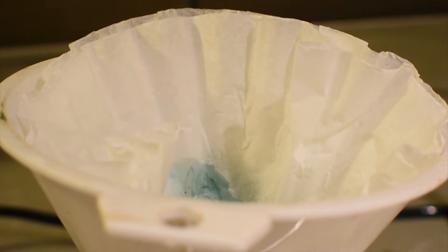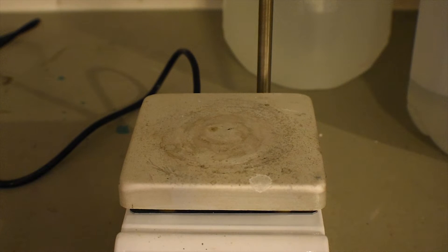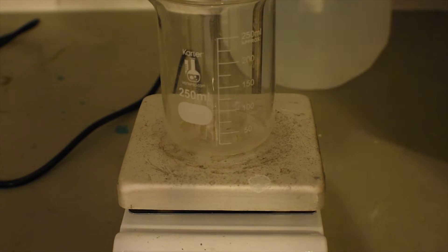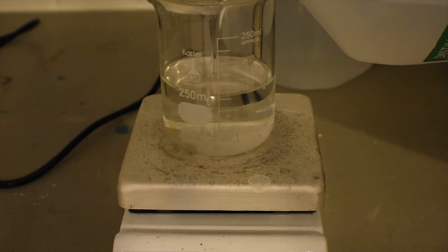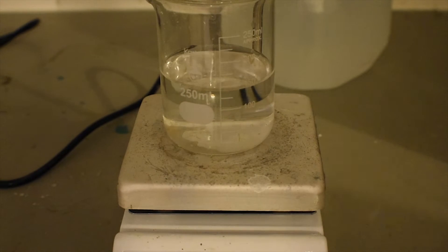While that's filtering, I'm going to go ahead and measure out 150 milliliters or so of distilled water and add to it the 20 grams of anhydrous sodium carbonate. This is the neutralizing solution. Acetylacetonate complexes can't really form under super basic or super acidic conditions, so you really need it to be about neutral. This should do it.